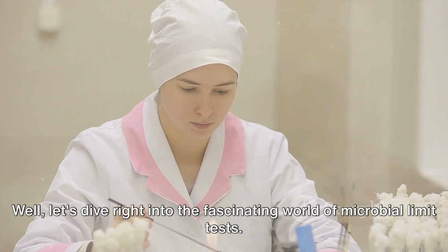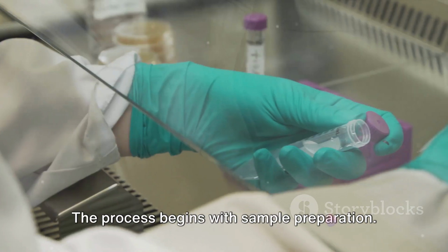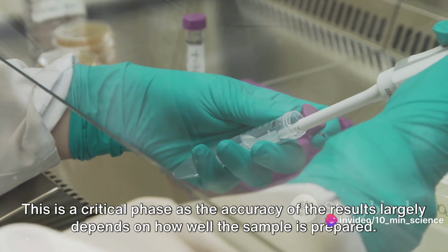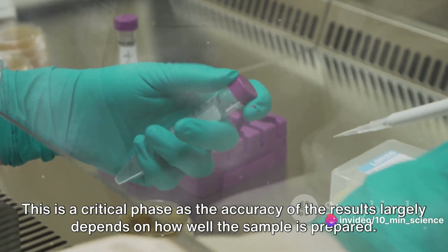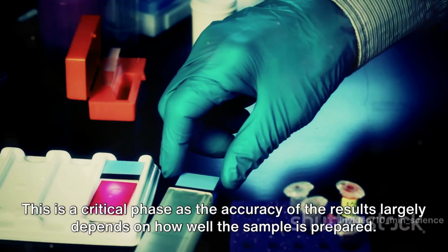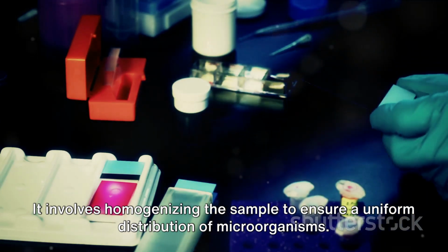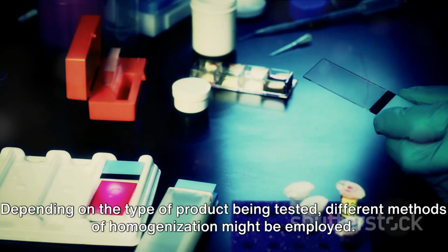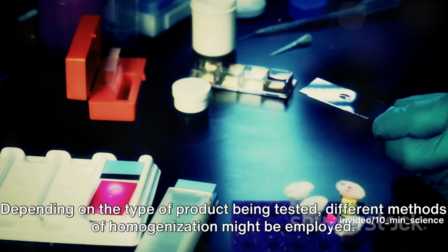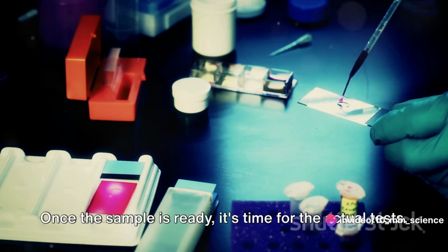Well, let's dive right into the fascinating world of microbial limit tests. The process begins with sample preparation. This is a critical phase as the accuracy of the results largely depends on how well the sample is prepared. It involves homogenizing the sample to ensure a uniform distribution of microorganisms. Depending on the type of product being tested, different methods of homogenization might be employed.